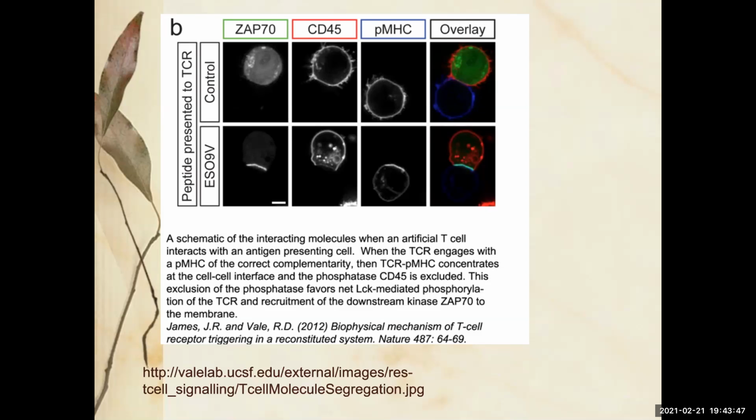This is another reason why, if you ever by accident should purchase or have to use a color camera in fluorescence, you'll soon be like, oh no, why didn't I buy the black and white camera? Everything's going to be much brighter. It's just going to be a better camera.